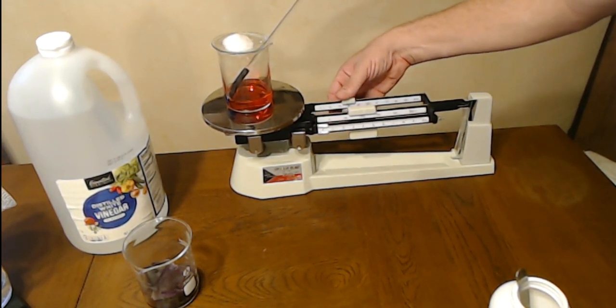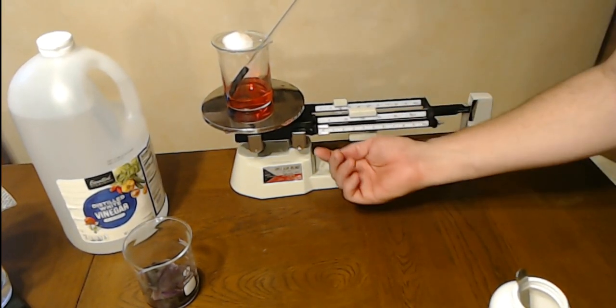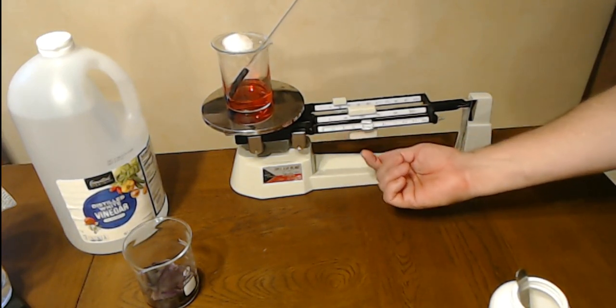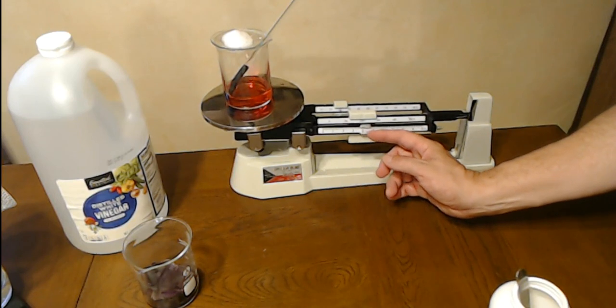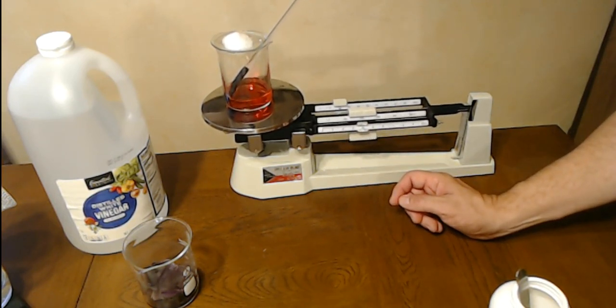10, 20, 30, 30 is too much. We're going to back off to 20. Now we're going to do our slider and try to get it to balance out. Okay, so went a little too far, it looks like. Yep, so we're going to slide back. Give it a second.